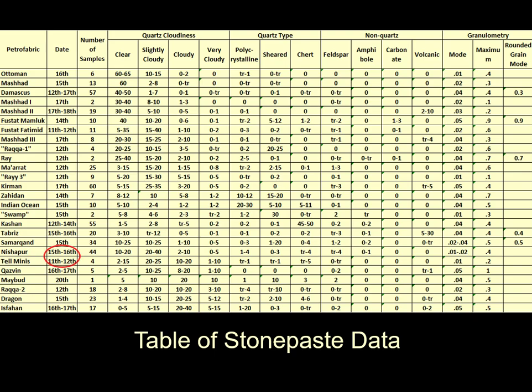Sometimes similar petrofabrics would never be confused because they are too far away in terms of time or place, like this 11th century Syrian lusterware centre versus this 15th century Iranian blue and white centre. Grain size can be problematic as the quartz is all processed, and in fact at least one treatise has said that the finer you grind the quartz, the better. Here are two centres where they have done just that.